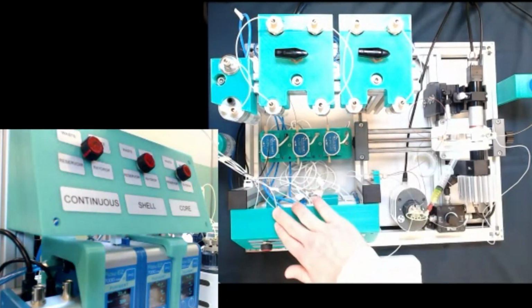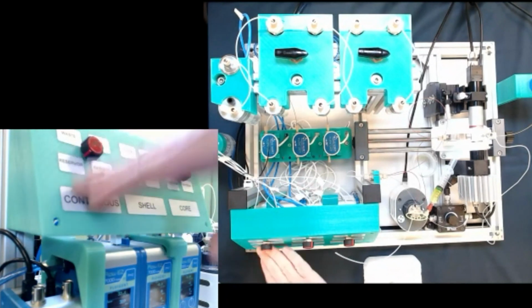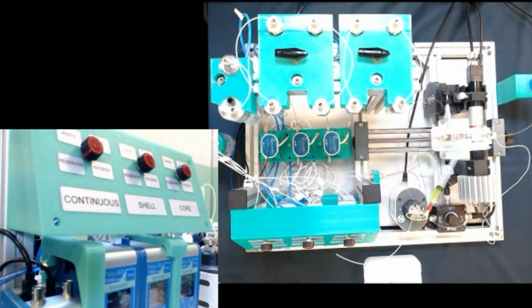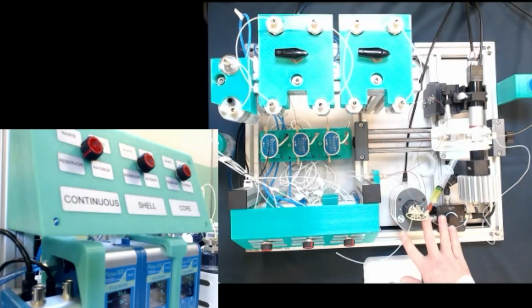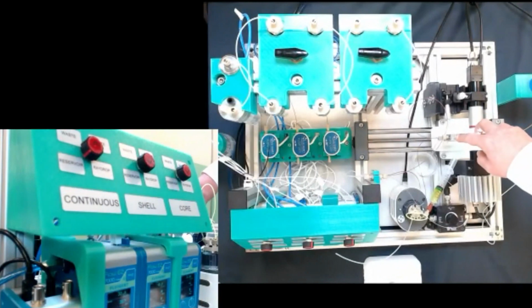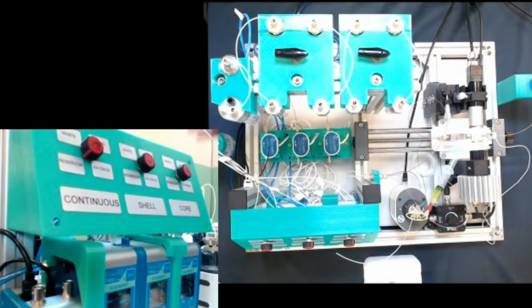A set of valves that are really helpful to start and prime the system, so you can switch from the reservoir to the waste or to the Raydrop for each phase. And it's really important to use this valve to start the Raydrop encapsulation process. Then on the right part of the video here, you have the injection loop right here. You have the Raydrop that is presented here, and then you have a small microscopic setup here that allows to see the emulsion generation and be sure that everything is working well.